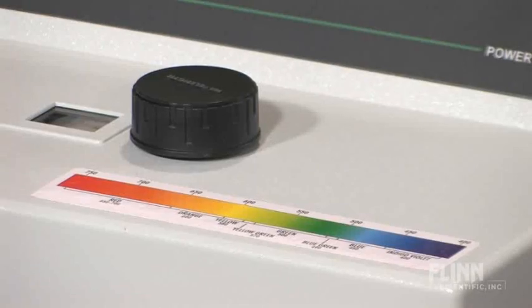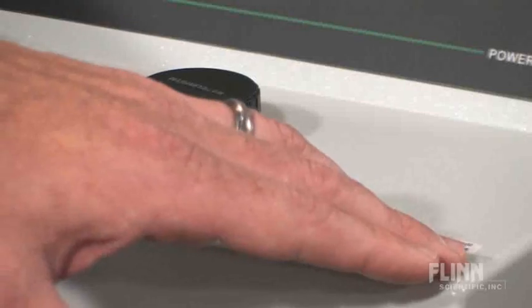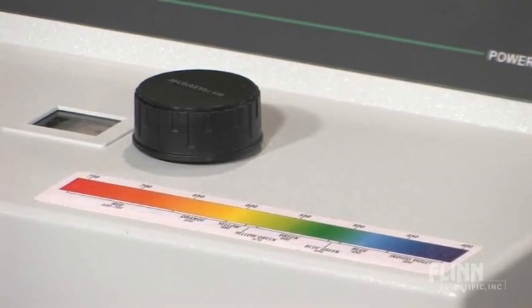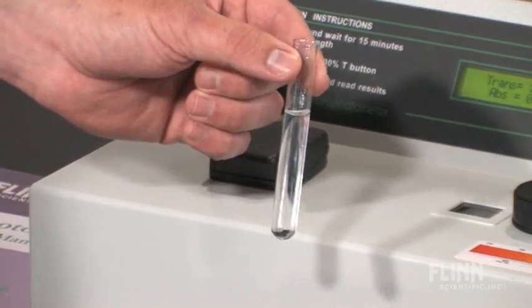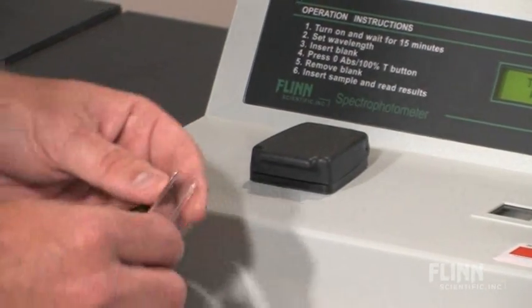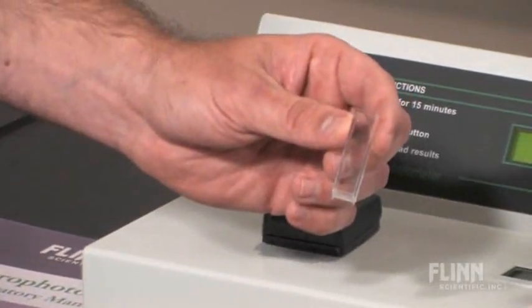It also has a colorful visible spectrum guide on the front of the unit corresponding to the wavelength ranges. It accepts 13 by 100 mm cuvettes or 10 mm square cuvettes with the included adapter.